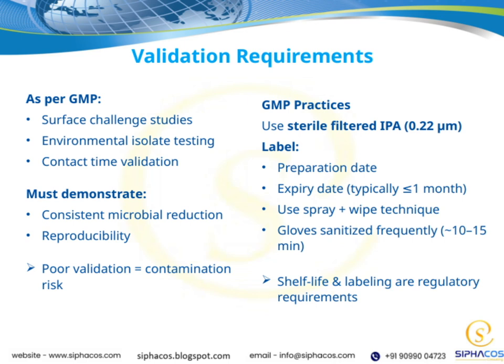Moving on to validation requirements, as per GMP, we need to conduct surface challenge studies, environmental isolate testing, and contact time validation.